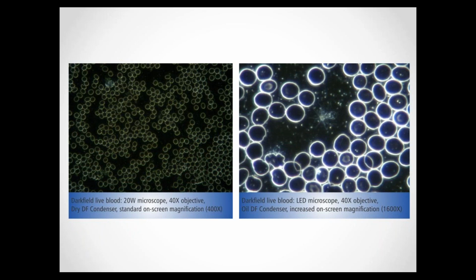So if you're not able to view blood properly in dark field, then you would miss those anomalies, and the treatment that you decide on in a case may not be the best and most appropriate for your client. I see. So this would also affect your experience as a practitioner with live blood analysis, because you may not see the results you expect to see in the practice. Well, yes, absolutely.